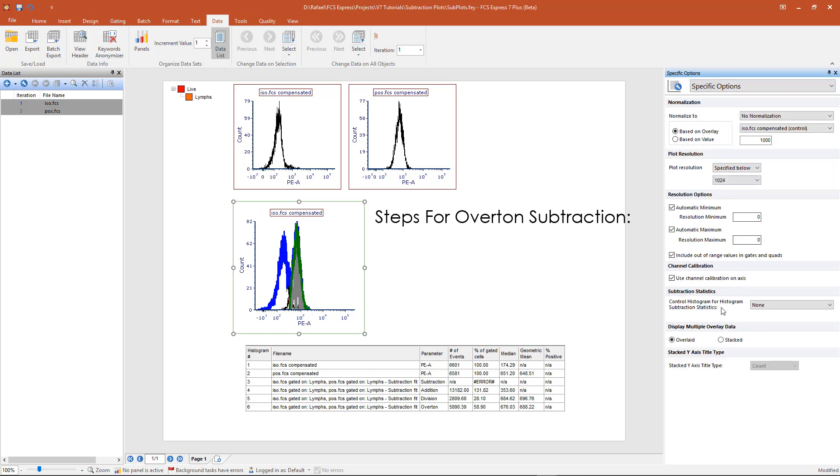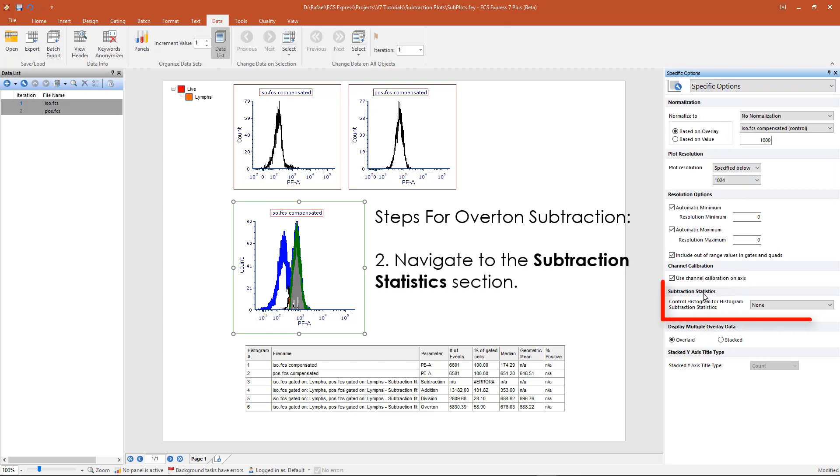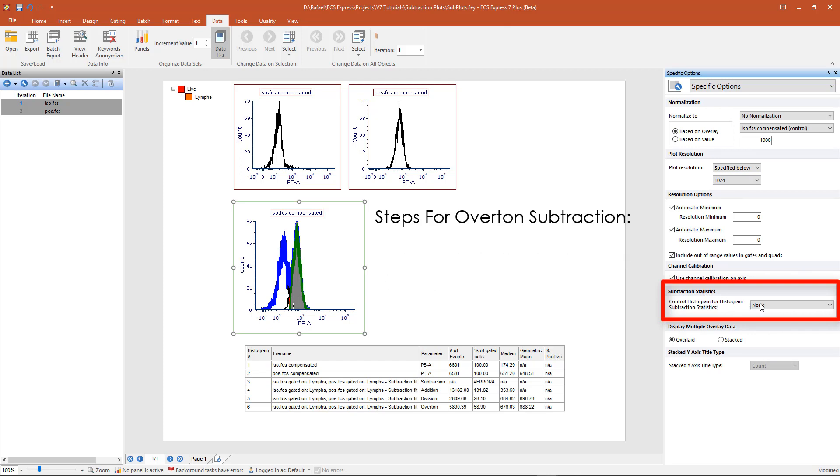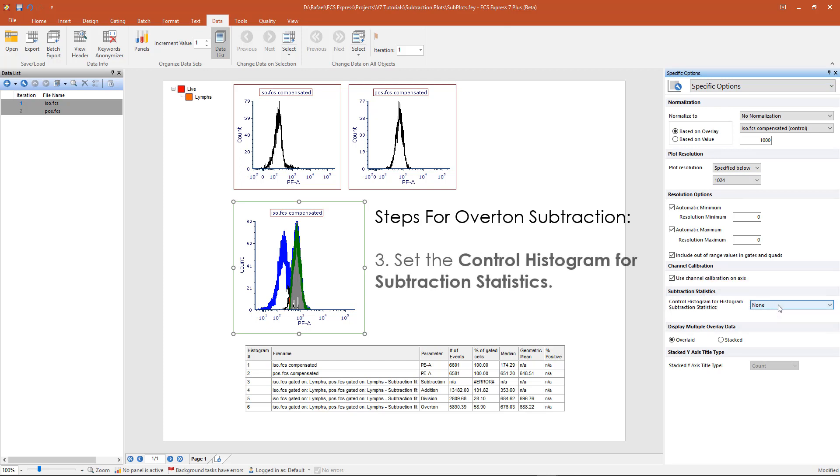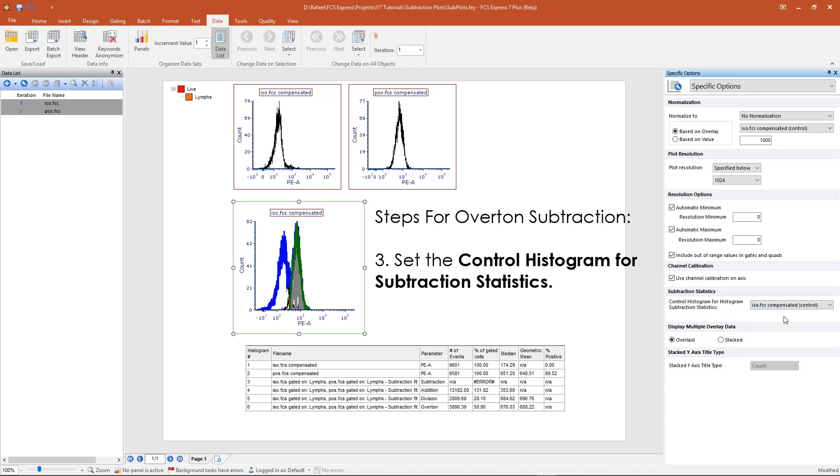To set the control histogram, go to subtraction statistics, then in the drop down menu under control histogram for histogram subtraction statistics, select the control histogram for your experiment.